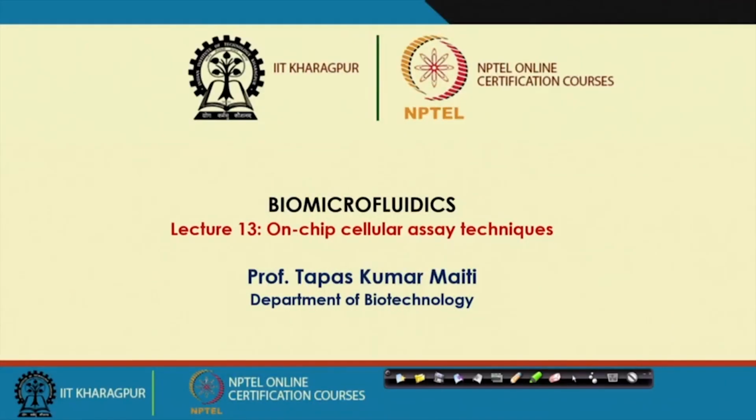In the present time, a number of experiments based on fluorescent microscopy in the microfluidic platform have been adopted to understand biological events. And in this lecture, I shall be discussing some of those microfluidic based experiments using confocal microscopy to understand mechanosignal transduction, which we are using in our laboratory.